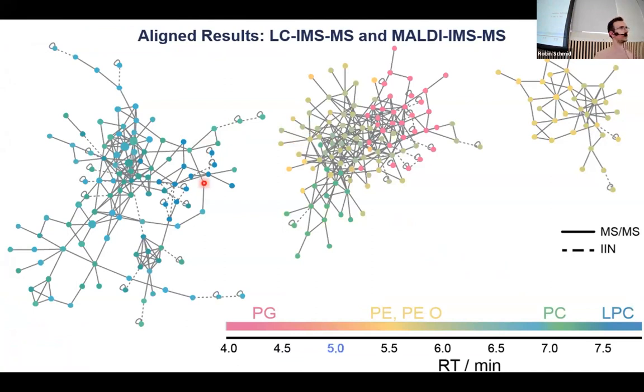Is any one of you actively using ion mobility in your lab? What are you using it for, just out of interest? Okay. Okay. Yeah, maybe it might also be interesting for you, because then you can use the same software for all your data sets.